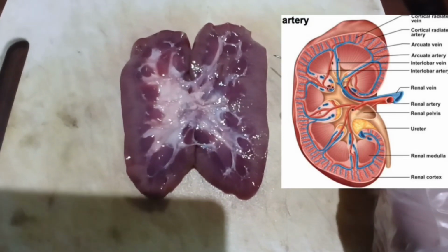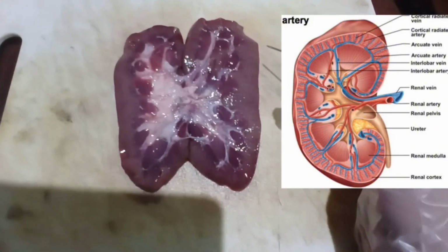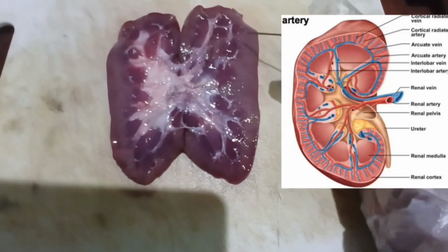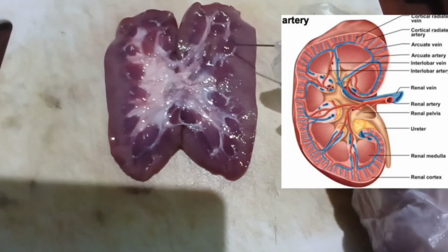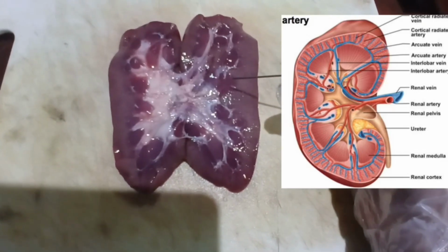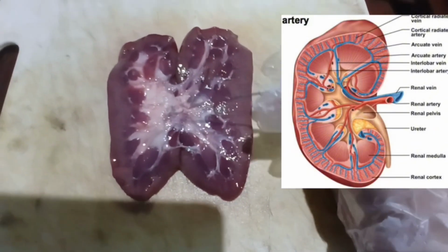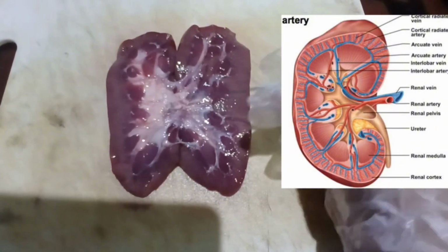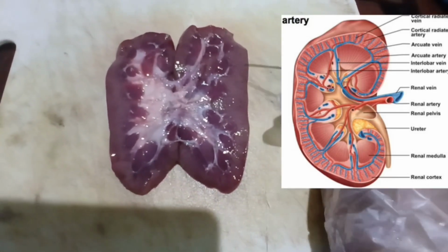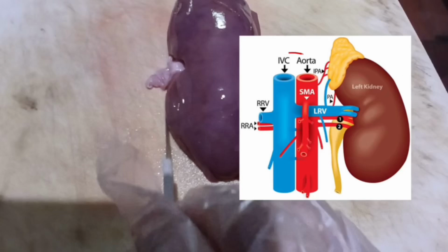process or transportation process. They're the ones that collect blood from the arcuate veins, and then we have the renal vein. The renal vein is the one that collects the blood from the interlobar veins. Now this one drains into the inferior vena cava. As stated before, the interlobar veins all converge into the renal vein, while the arcuate vein converges into the interlobar vein. It's like that kind of process where they're transporting blood to each other. And again, going back to the renal vein, this collects blood from the interlobar vein and then drains it into the inferior vena cava.